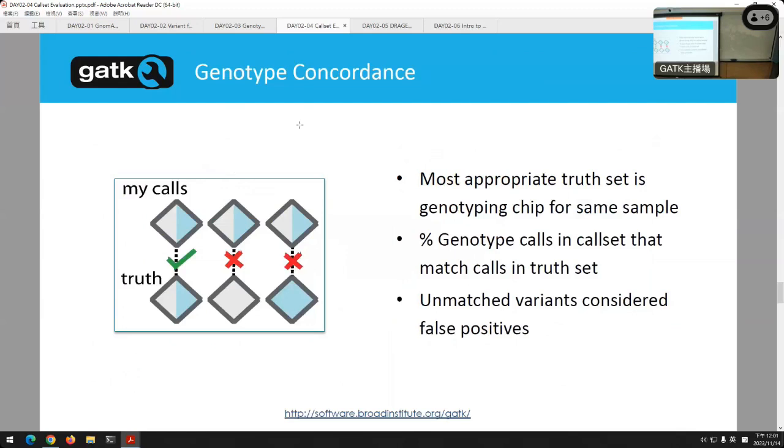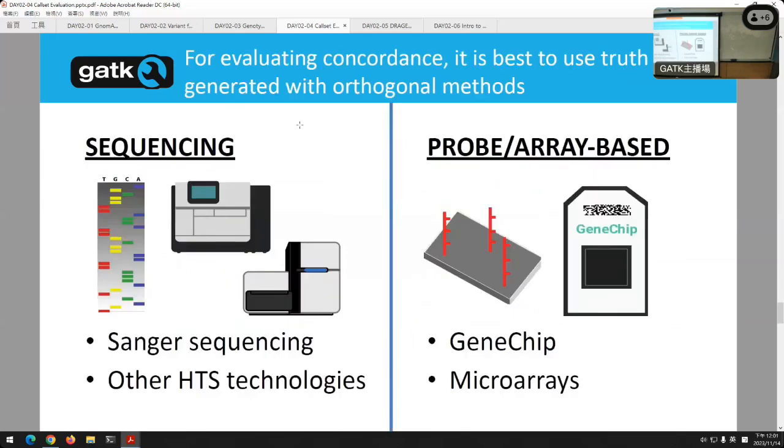Maybe you're not doing human sequencing, right? One of the things you can do to simulate a truth set is actually run the samples as much as possible through different sequencing technologies, similar ones. You don't want to jump too much, but even among short read technologies, different ones have different characteristics. Sanger is expensive, but really high accuracy. Different technologies have their own different sources of biases.